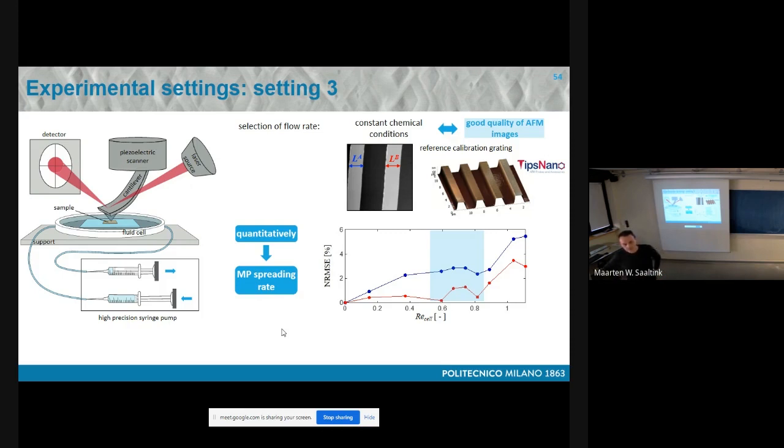Also, one aspect for the carbonates is that the transport limitation, the influence of the transport in the reaction, is also an important factor. It contributes to the saturation state of the solution. I would say that your residence time is very, very large in your experiments, and then you have a lot of influence of this diffusion transport effect. Let's put it like this. Like I said, according to the measurements that we took of the chemical composition, we are still far away from equilibrium. Of course, you have a variability. Yes, I agree. Within these 6 minutes, yes.